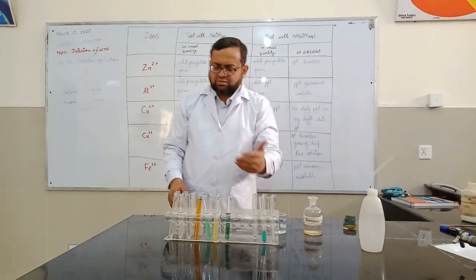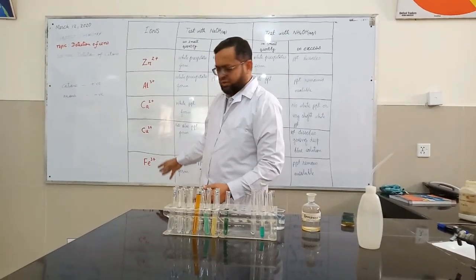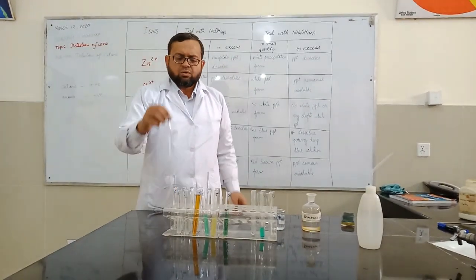I will show these later on because up to this point we have only these 1, 2, 3, 4 and 5 ions. Okay, now we start.